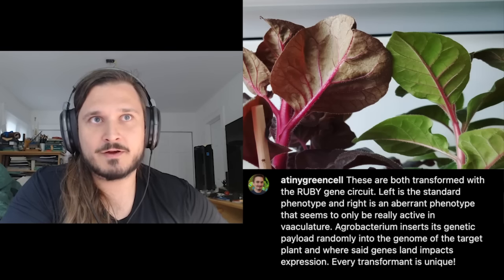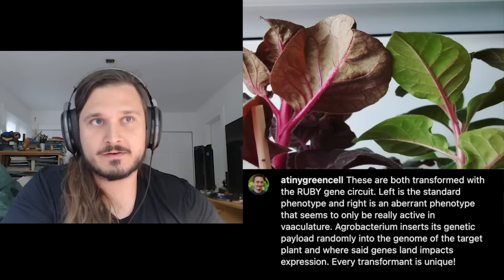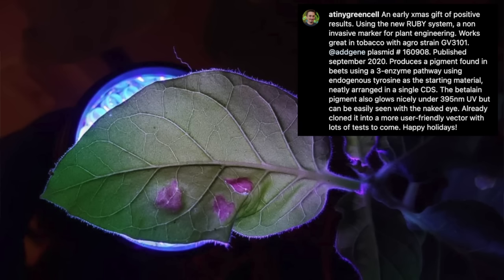An Agrobacterium run, if you're using a model organism that agro likes to bite on, like tobacco, for example, I get efficiencies of 85 to 95%, right? So 85 to 95% of all the leaf discs that I hole punch and expose to agro will produce a transgenic plant. While with tissue culture, with a gene gun, we get about 0.1% efficiency. So you really have to shoot a lot.